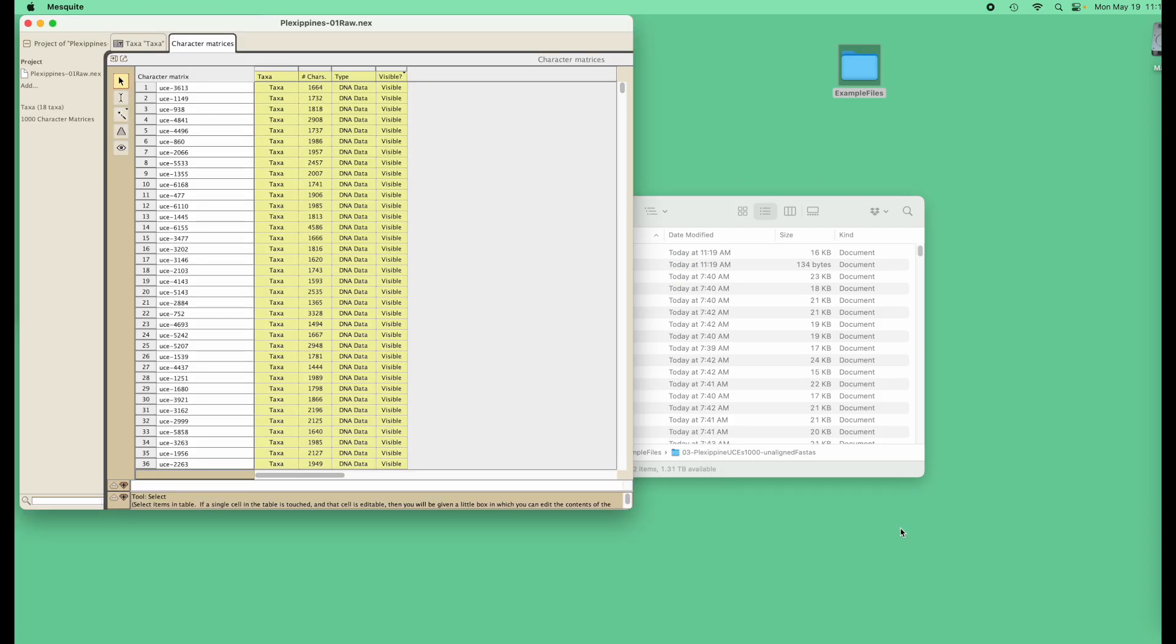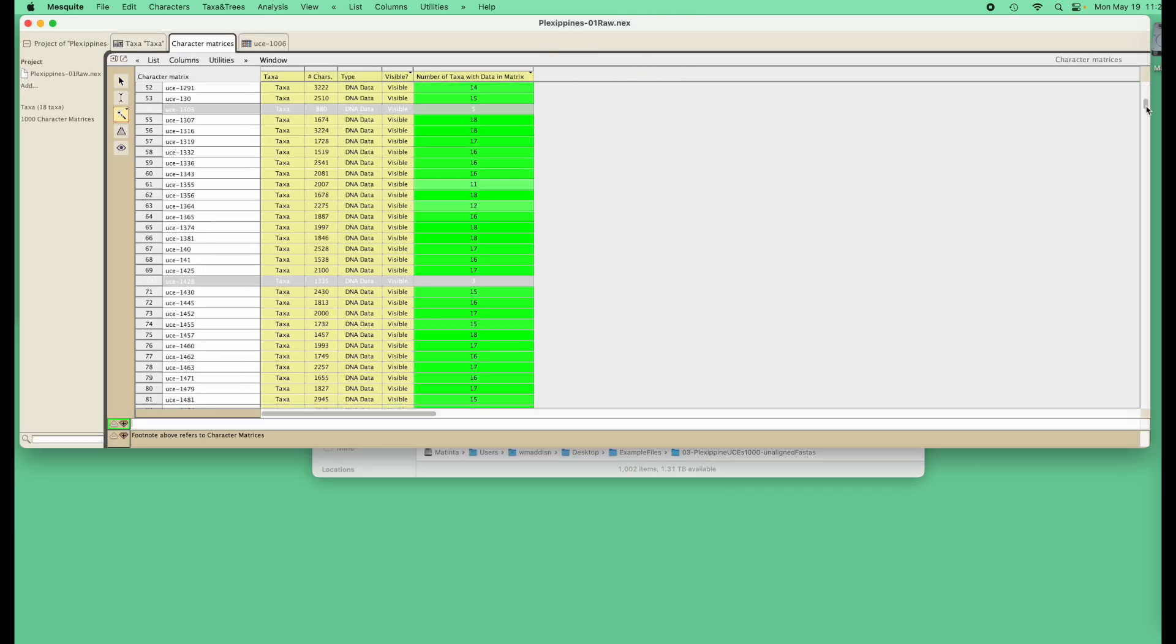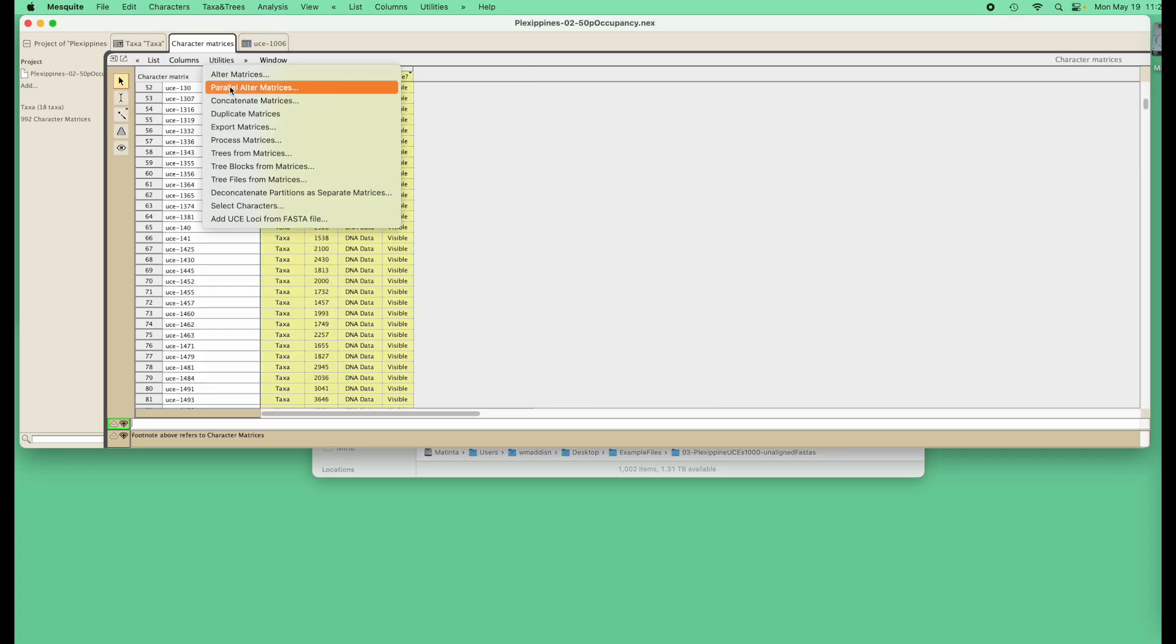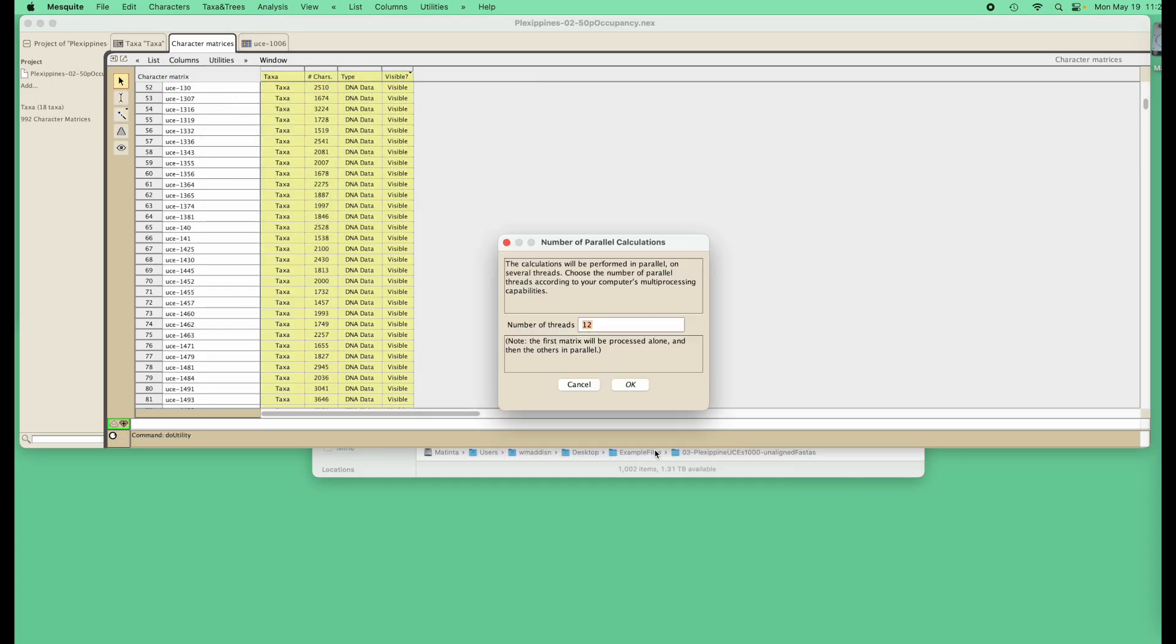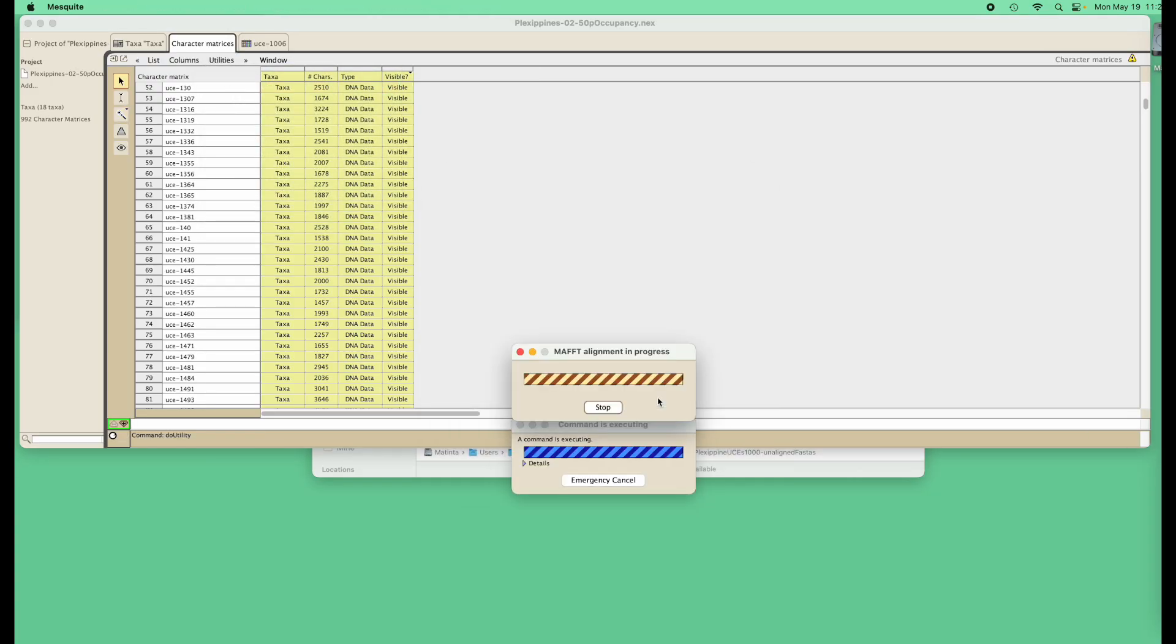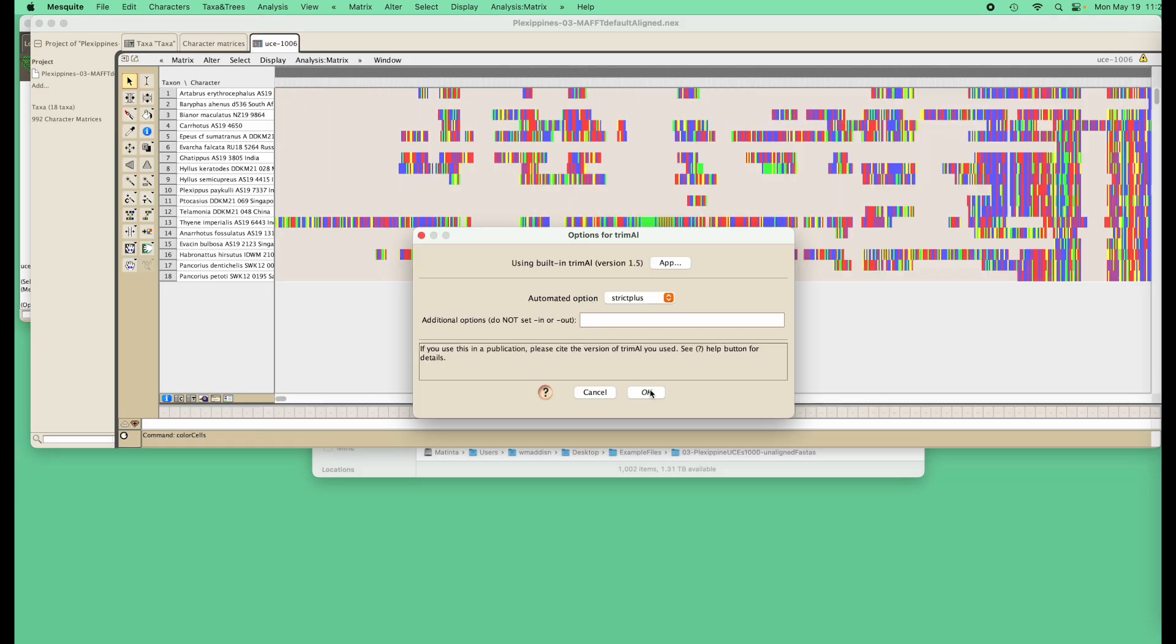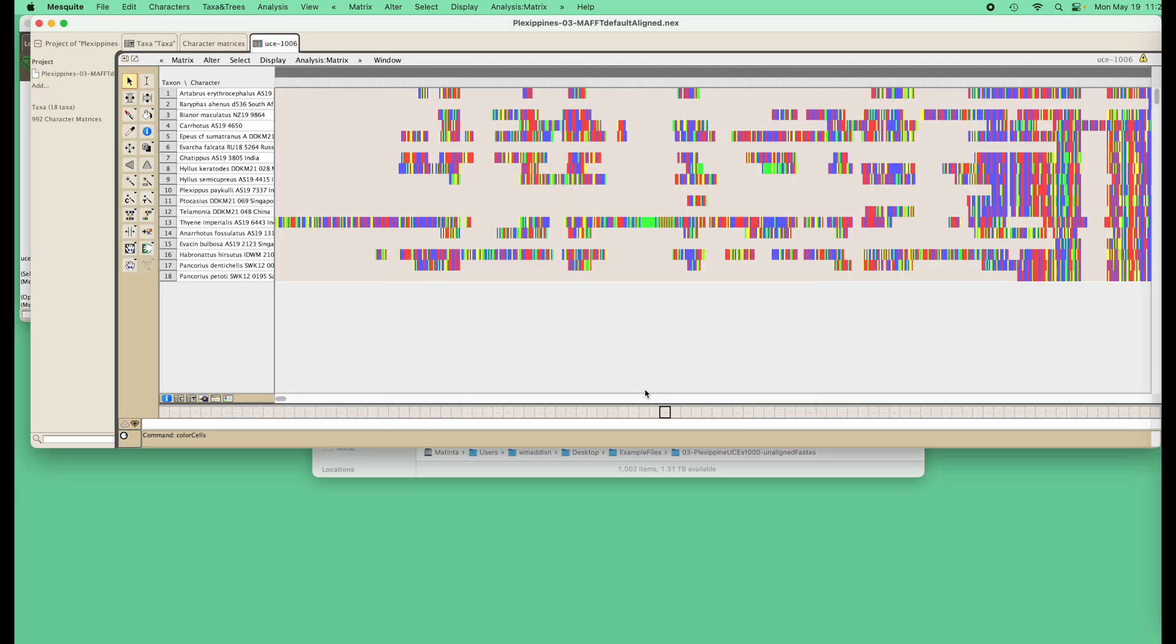We've added a lot for phylogenomics, including a transparent pipeline in which you can follow your thousands of genes from input through alignment, trimming and concatenation, and various tree analyses.